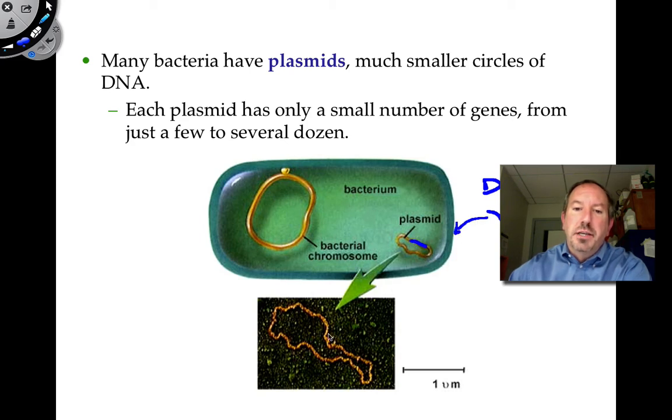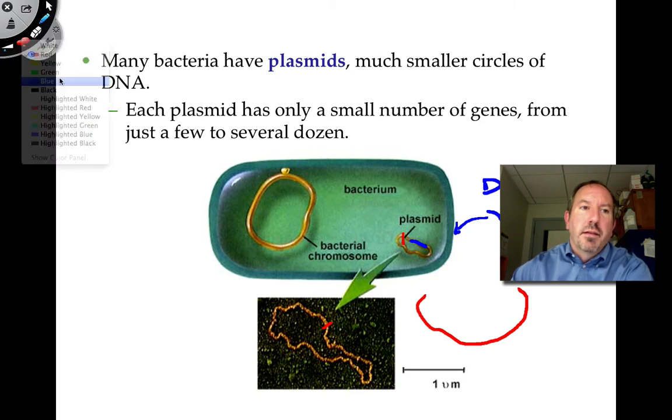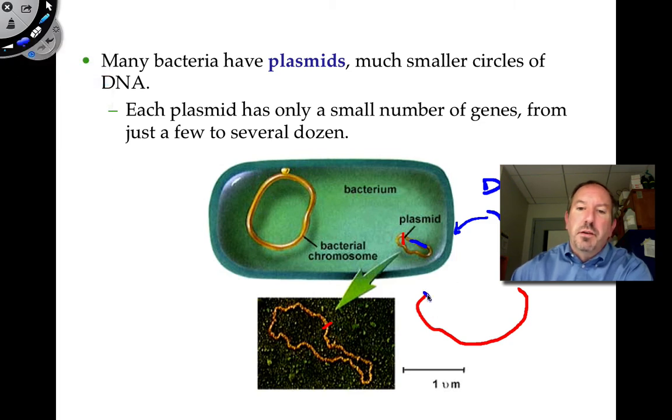Now, the plasmid, as you can see, is a circle, so this might pose a problem, but not so much. We're able to cut the plasmid open using an enzyme, and then, let me draw it like this, we have an open loop, and we're going to take the redwood DNA. You might be surprised that we can do this. I am a little bit also.